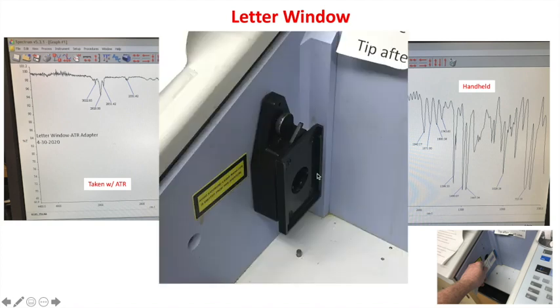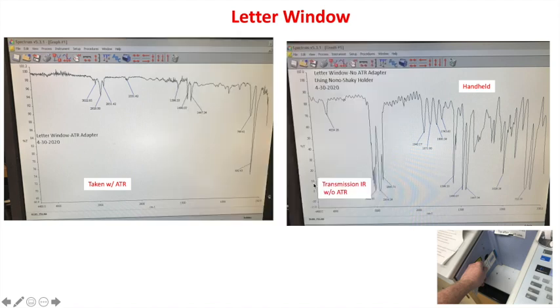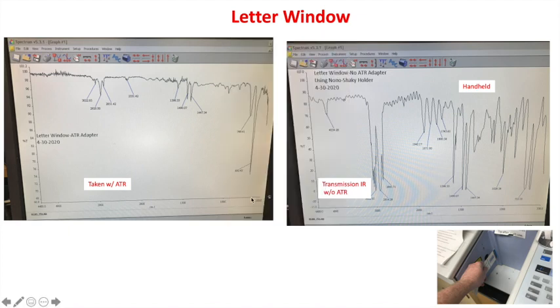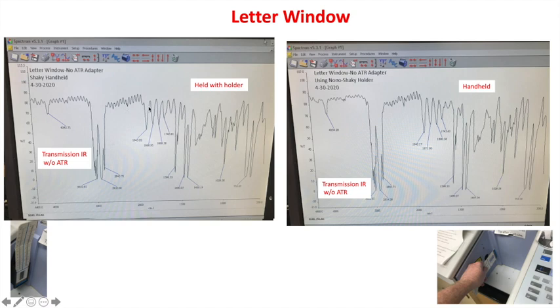So I tried it again with the little holder. This is where the ATR adapter normally goes, but you could screw in this holder and then it'll hold on to the plastic for you. So now it's completely still at a certain distance the whole time. And when I took the IR of it then, it looks the same to me.